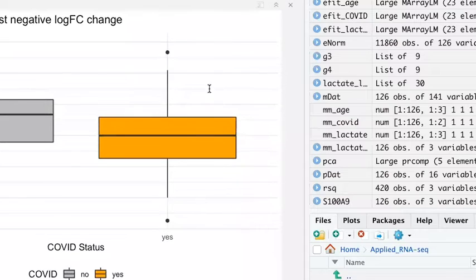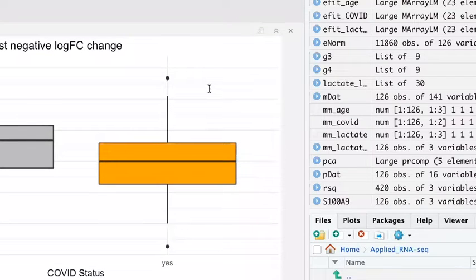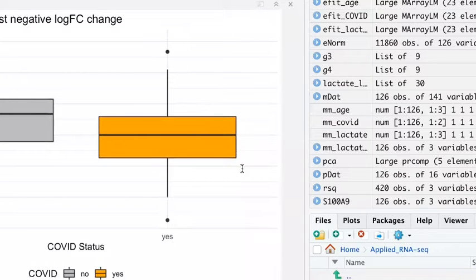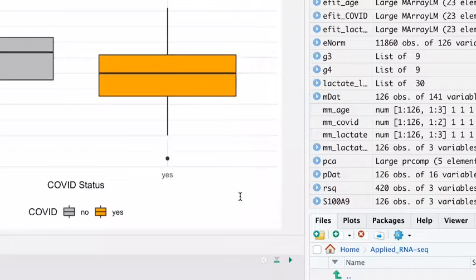So it might just be that, because I do sometimes see genes which have quite a few samples within a good average range, but then these outliers just drive that a lot. But in that case, you'd have to go back, take those out and then rerun the model again. Yeah. Okay. Any more questions on Zoom?